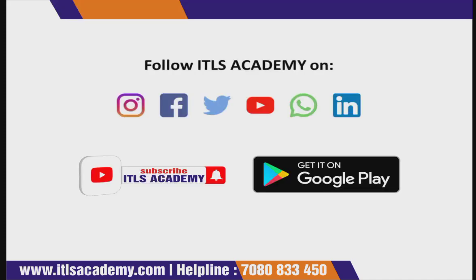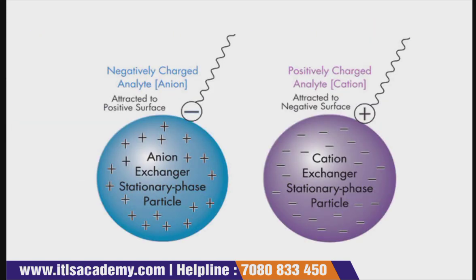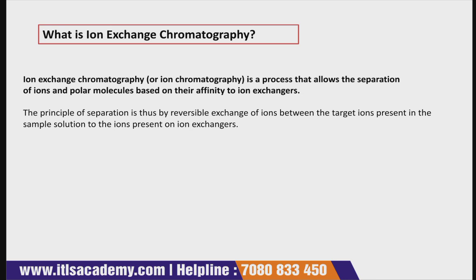So that brings us to the end of the lecture. Let us quickly understand what types of questions can be asked in interviews. In interviews or while giving any examination, this question is very important: what do you understand by ion exchange chromatography? Or they can ask you on which principle ion exchange chromatography works. So you must know the principle as well as the definition.